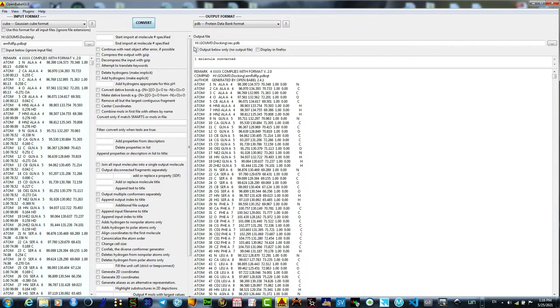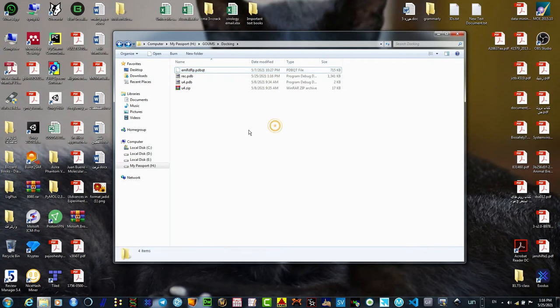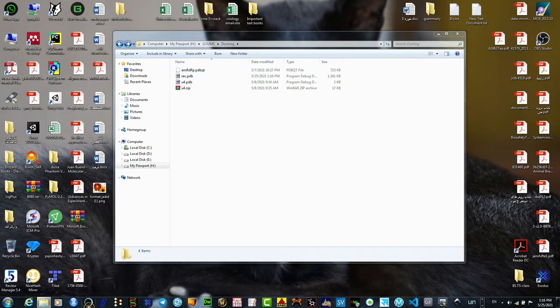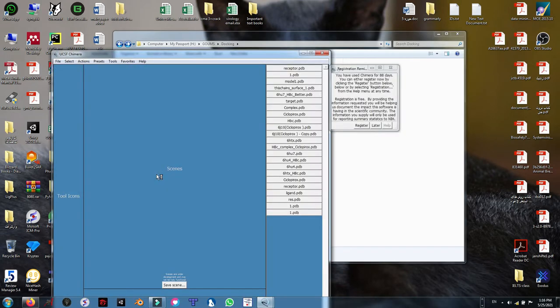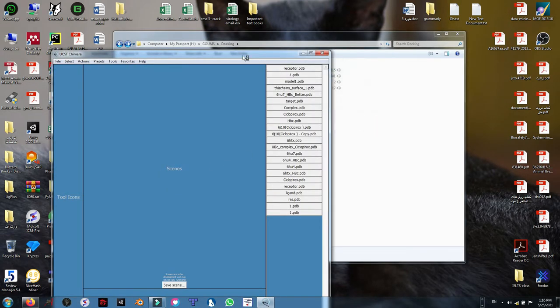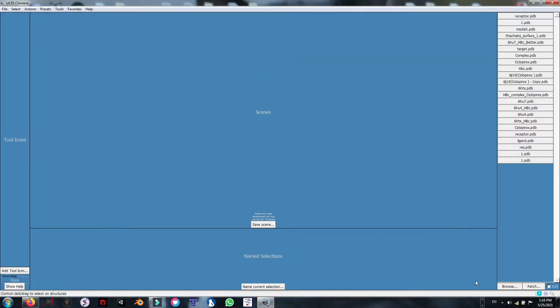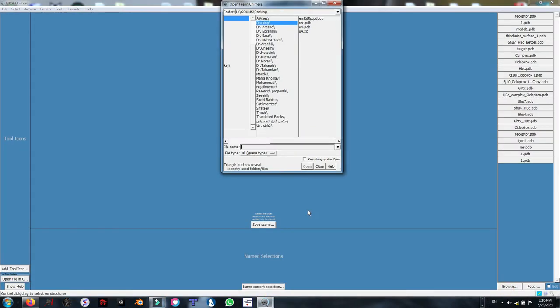Click convert. There is no need to change any item here. Use the default setting. Let's open the Chimera.